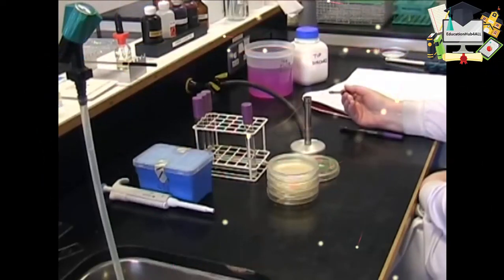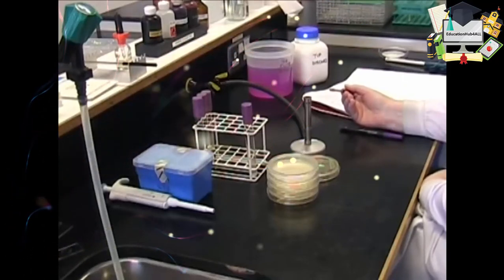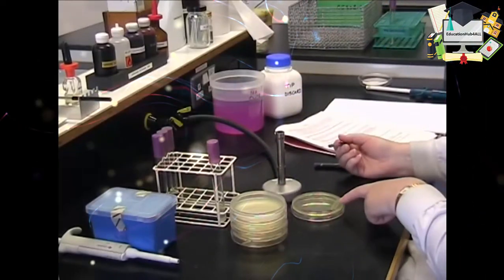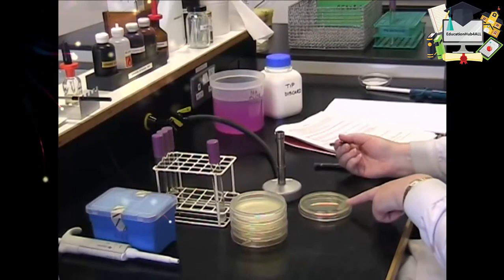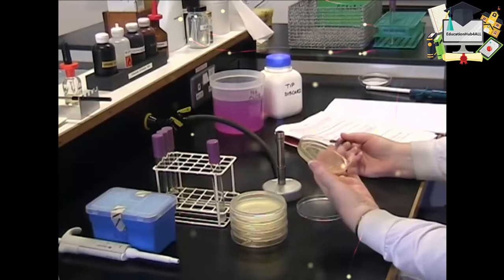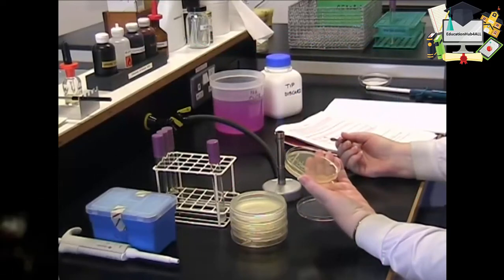It's important to remember not to put this down on the bench now, otherwise you'll have to start again as you will have contaminated it. We're now ready to work with our bacteria. When you see an agar plate in the lab, it'll always be presented to you lid down. That enables you to pick it up and have the bacterial side in your hand, ready to work with.